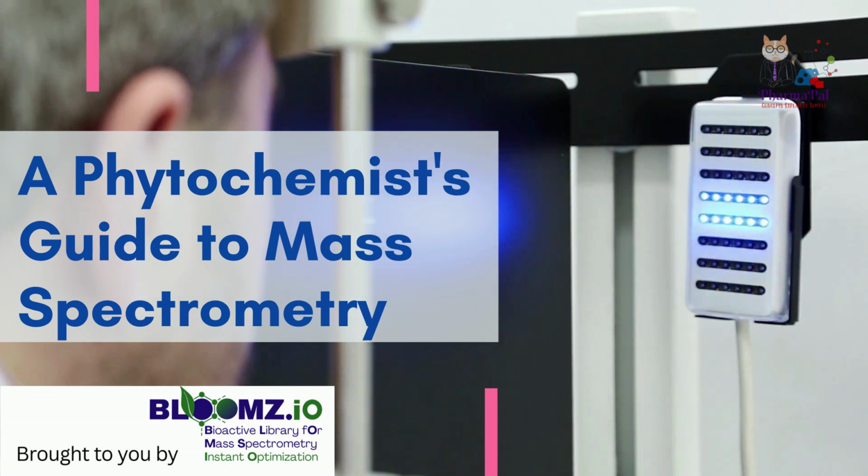Today, we're digging into mass spectrometry, specifically from the perspective of a phytochemist. What do you really need to know about mass spec to find those bioactive ingredients in natural products? Exactly. We've got some insights on this, and our mission is basically to unpack the essentials, focusing on how phytochemists use it and can optimize it. It's a big topic. Everything a phytochemist needs is a lot. Yeah, definitely. But the core, I think, is using mass spec effectively to identify active compounds in those really complex natural mixtures. Let's focus there.